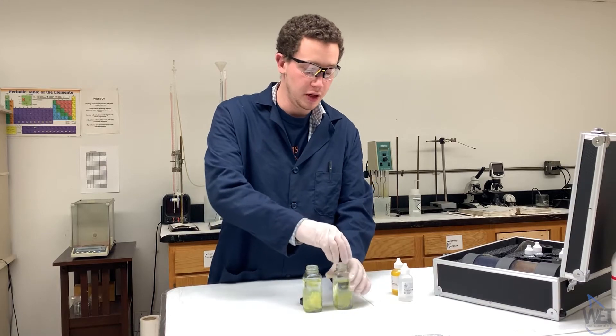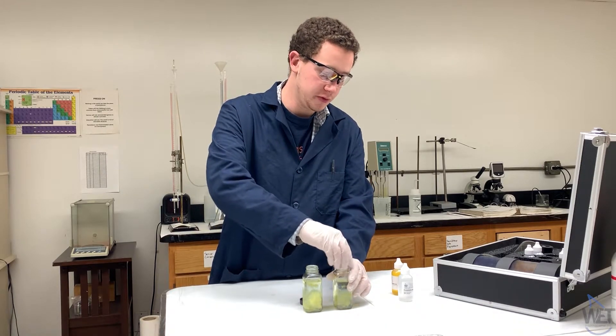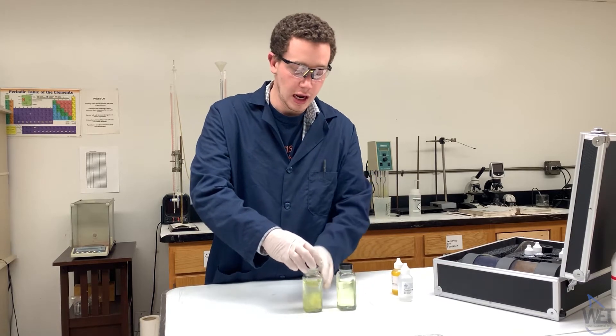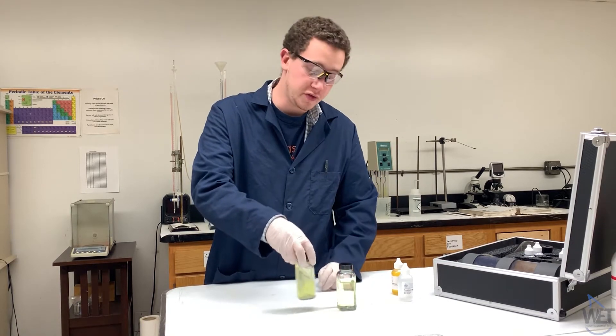Then cap the glass bottles, give them a little mix, and let them sit and react for 15 minutes.